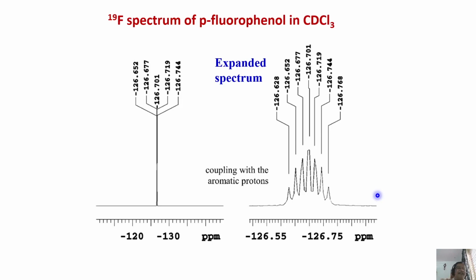Heteronuclear in NMR jargon is anything other than proton. Okay, that's called heteronuclear. Of course, heteronuclear means anything. But when carbon is observed, proton is heteronuclear, doesn't matter. But in NMR colloquially we say, I'm looking at a heteronuclear spectrum, meaning other than proton. This is a convention. Of course, it's not that you should not see proton. Okay, now let us look at the fluorine spectrum of parafluorophenol.